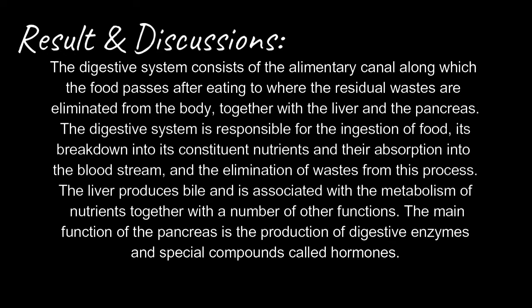The liver produces bile and is associated with the metabolism of nutrients together with a number of other functions. The main function of the pancreas is the production of digestive enzymes and special compounds called hormones.